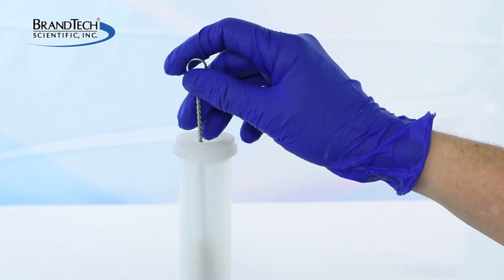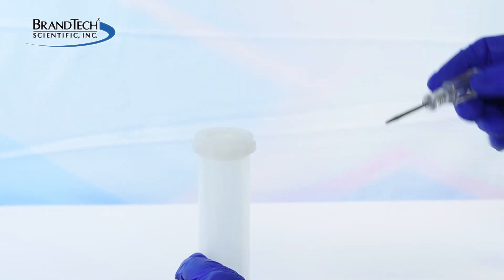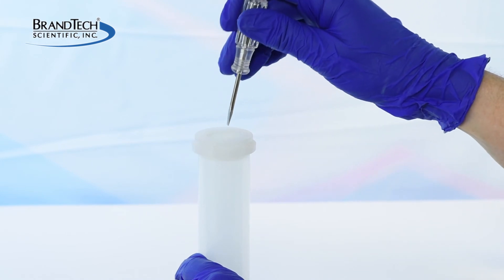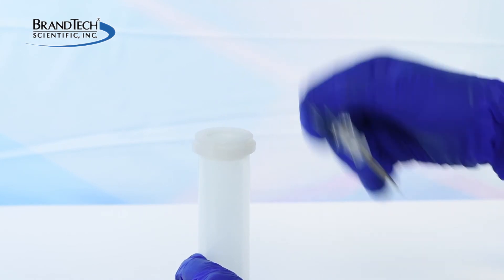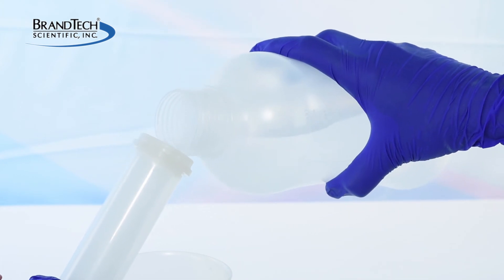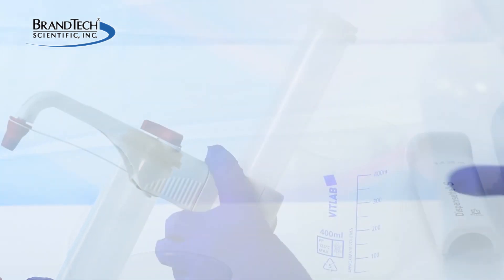Clean the piston and the cylinder with a soft bottle brush. If crystals have built up on the top of the cylinder, they can be scraped away, taking care not to scrape inside the cylinder. Flush inside the cylinder with deionized water.